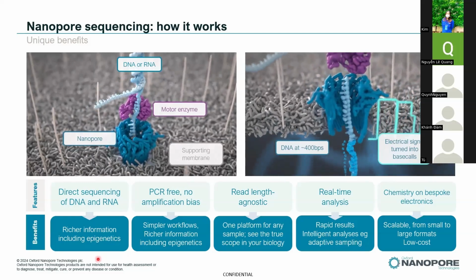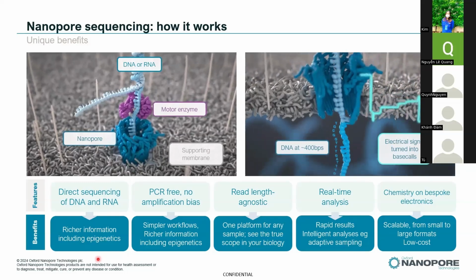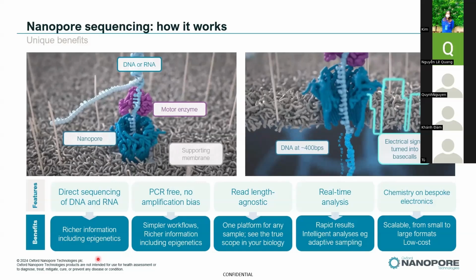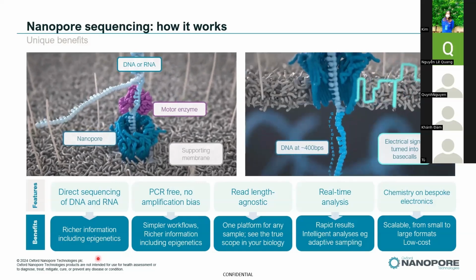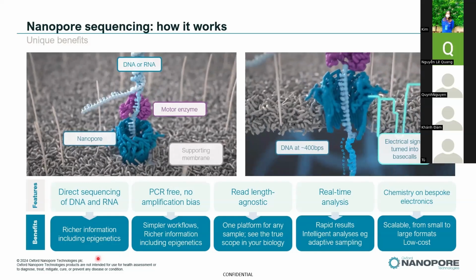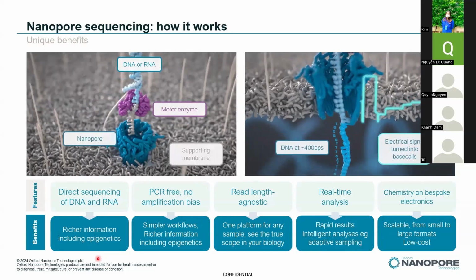And in some cases, the reverse transcription fails to cover the full length of the RNA molecules, which results in incomplete transcripts. In addition to that, you also get the benefit of preservation of the strand information.